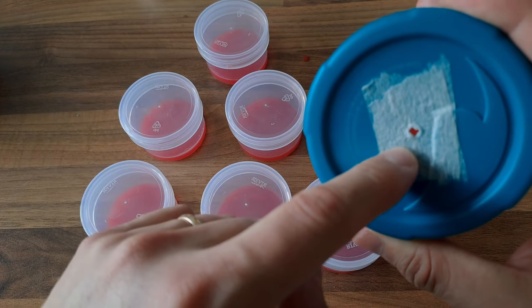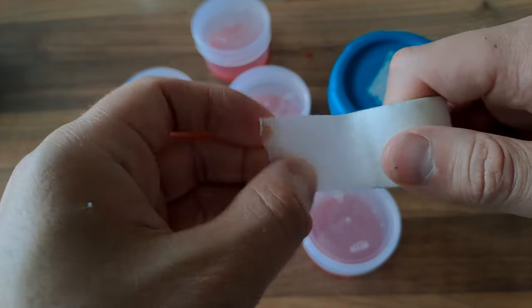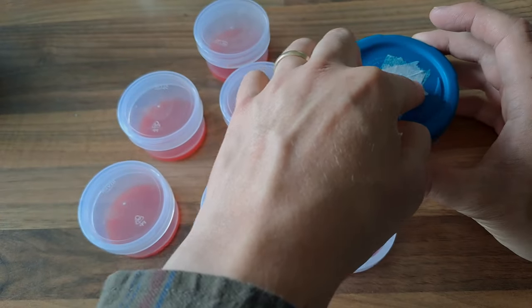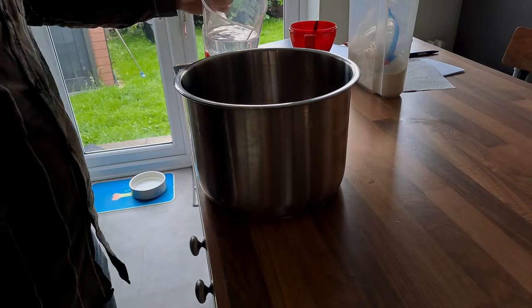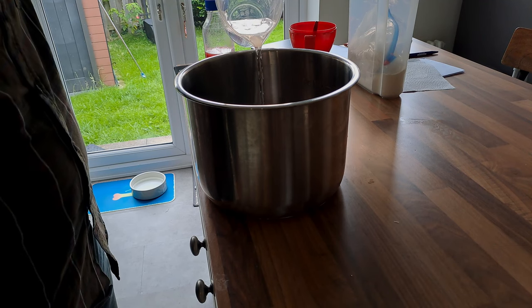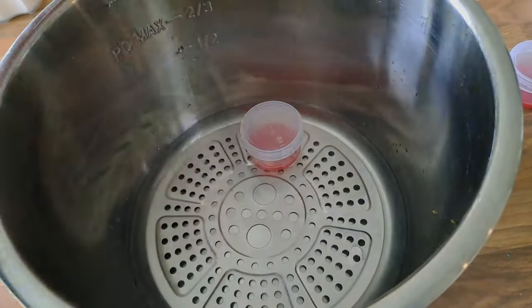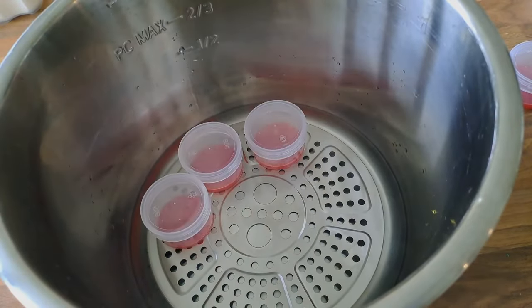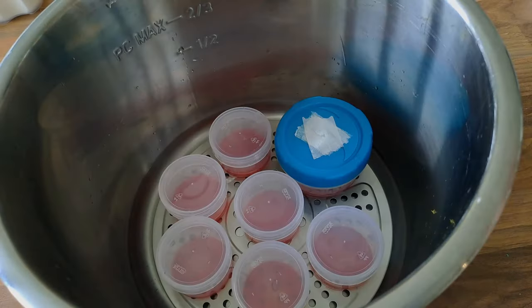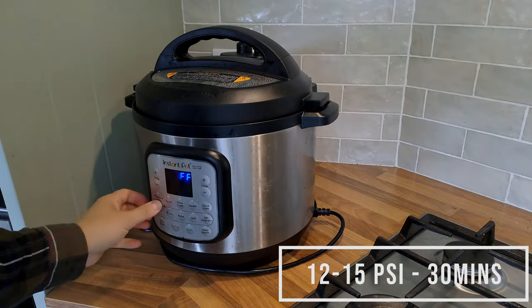If you're using modified lids with a hole in the top, then just put a layer of Micropore tape over the hole. Put the lid on all of your jars and then place them into the pressure cooker. Sterilize your pots for 30 minutes at 12 to 15 psi.